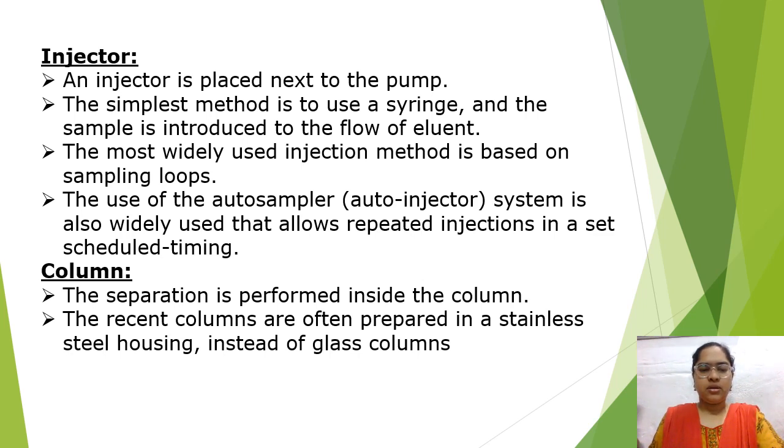Next one is column. The separation is performed inside the column. The liquid or solvent separation is done inside the column. The recent columns are often prepared in stainless steel housing instead of glass columns.